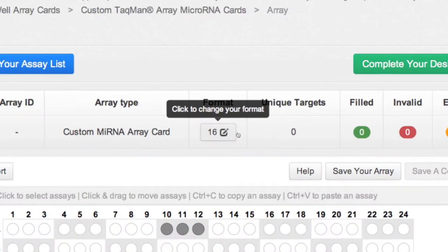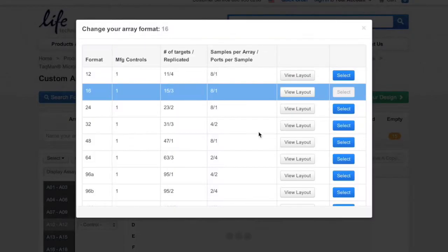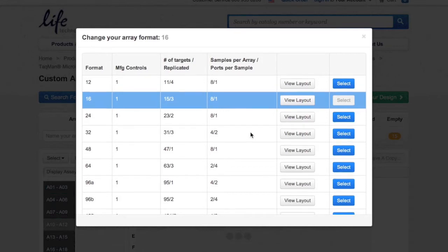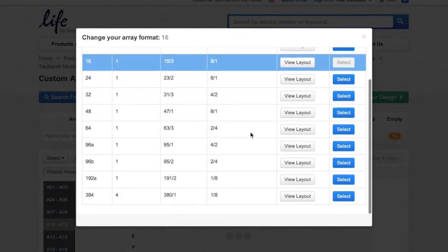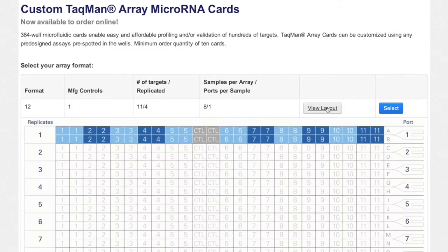If you're looking to search for microRNA targets and are uncertain of the final number of targets for your design, you can choose a format based on the number of replicates and change the format at any point if necessary. Click the View Layout button to ensure this assay card is the format you desire.